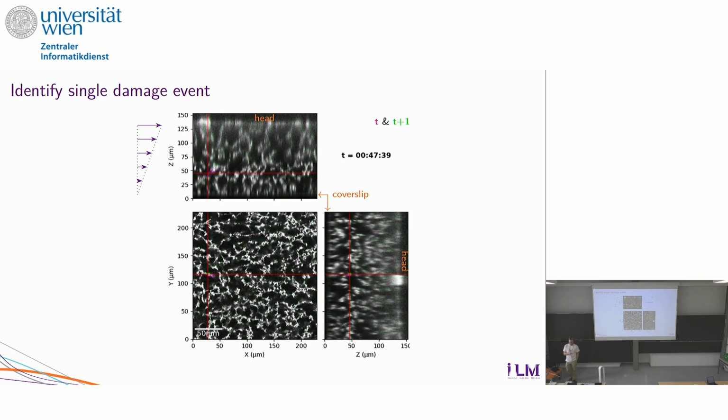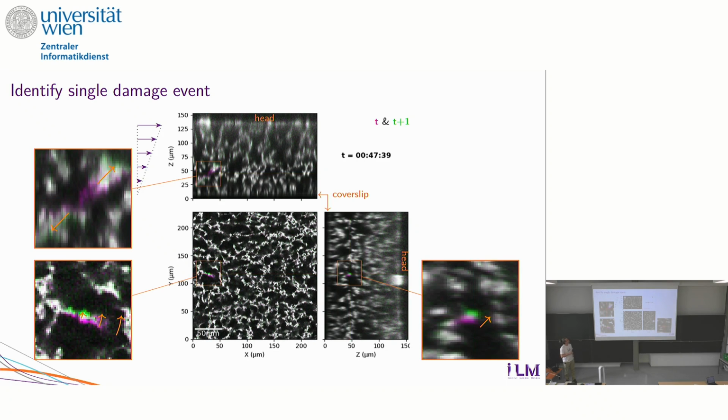What I want to stress here is that all the rest is completely gray, meaning there is seemingly nothing happening in all the rest of the volume that we're looking at. But if we zoom and remove the cross, if we just look in that region, you'll be able to see that that strand got pulled apart like this. So this you would expect because you're in the shear plane there, so you actually expect that things will be pulled in the shear plane and probably in this maximum elongation axis of the shear.